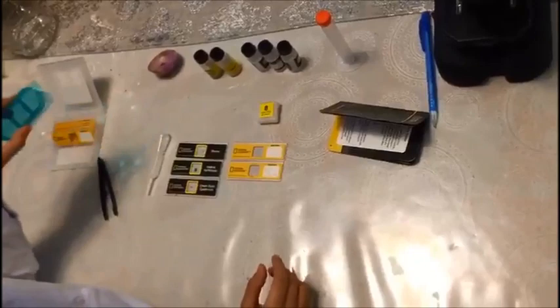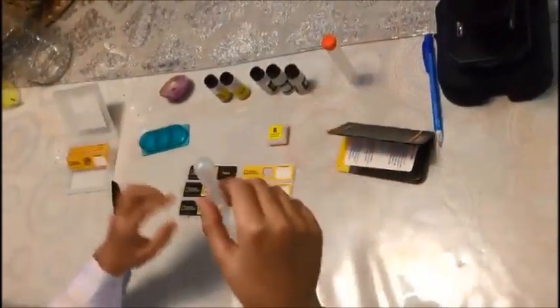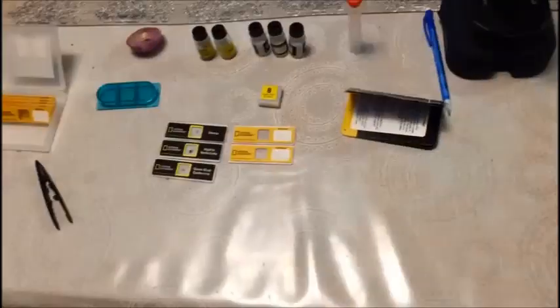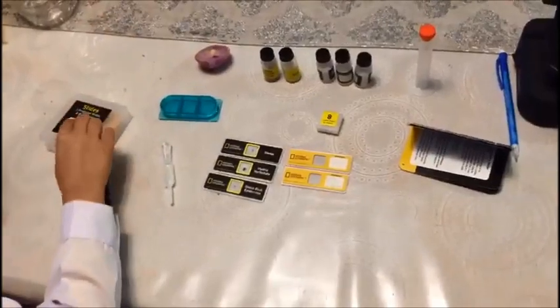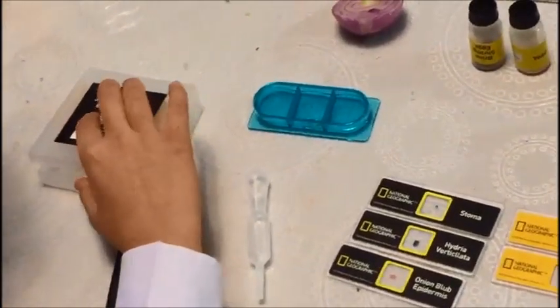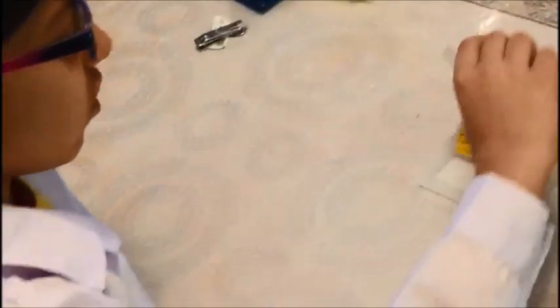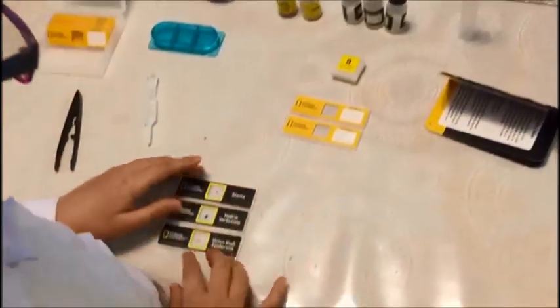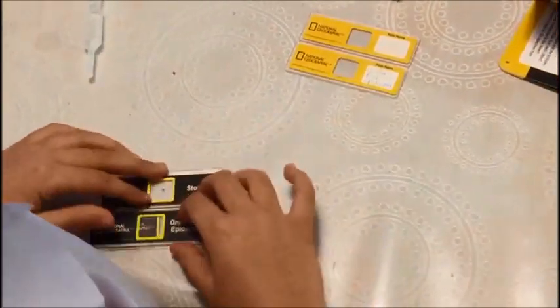It comes with a hatchery and this container which is filled with water. And it has this box which says slides — three prepared slides and eight plain slides — and it has these little pictures. There are also three fake prepared slides to show you an example of the real type of things.